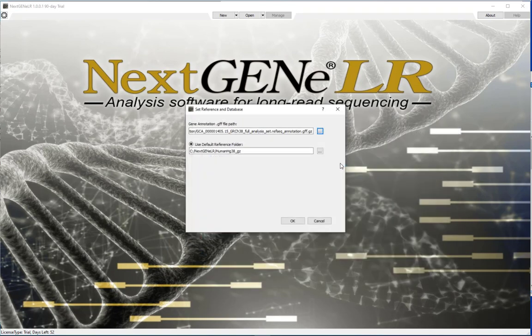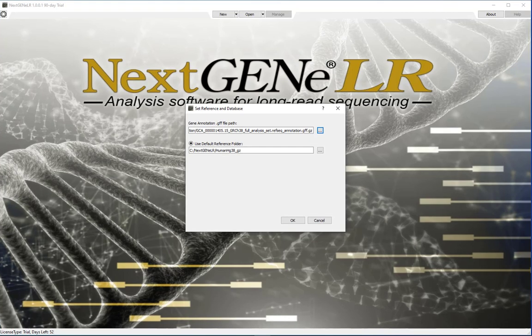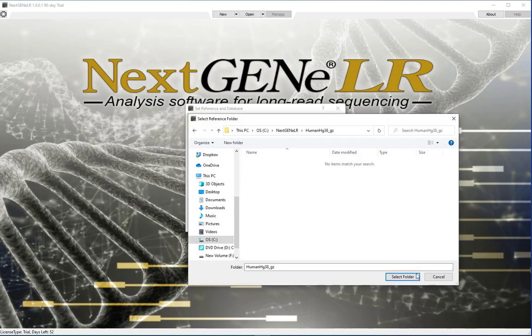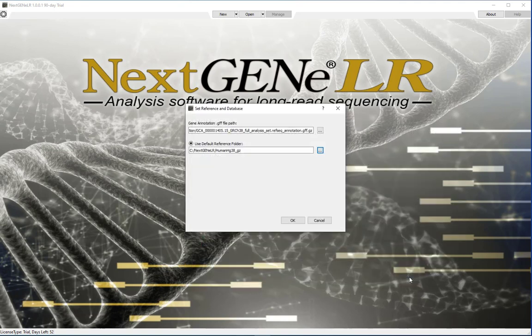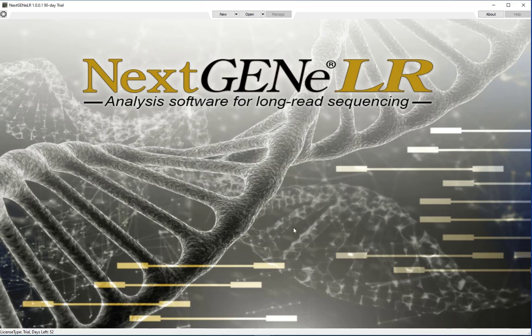Click the button to browse to and select the saved GFF.gz file. The next setting allows you to define a default reference folder. When loading reference files, this directory will be opened by default for convenience. Click the button to browse to and select a folder where your reference files will be stored. Click OK to save these settings and close the settings dialog.